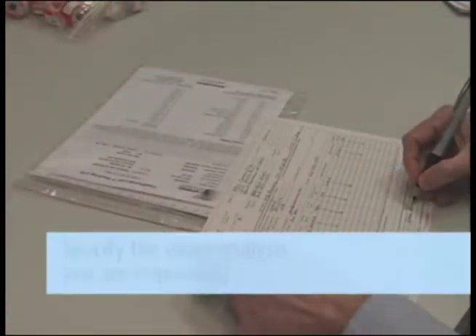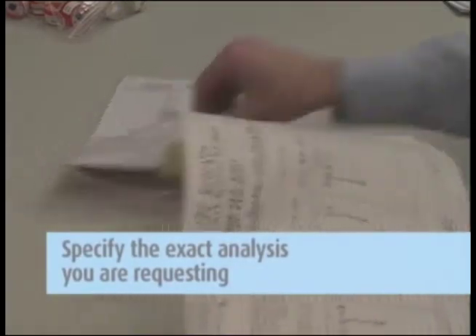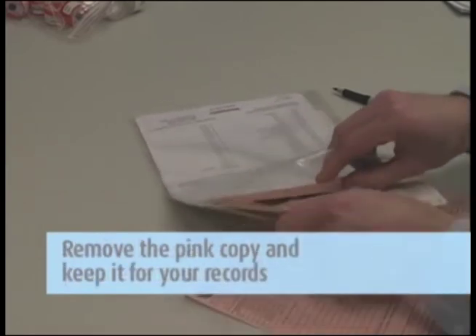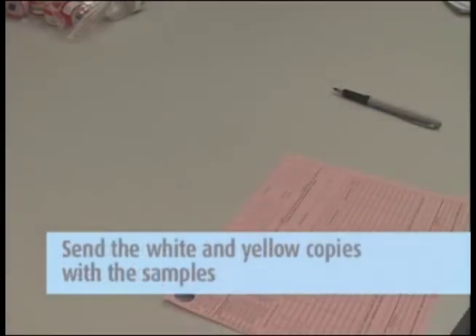Then complete the chain of custody form. It is important that you include all the information requested in order to ensure the turnaround time of your samples. Remove the pink copy and keep this for your records. Send the white and yellow copies in with the samples to the lab in the large Ziploc bag.